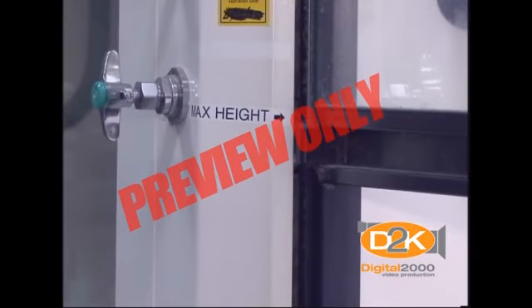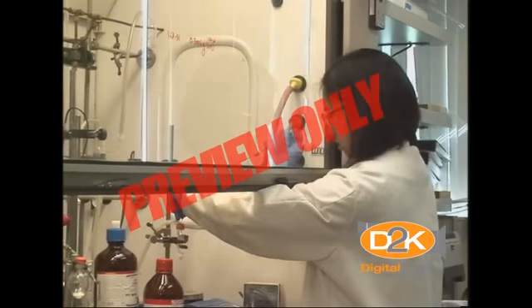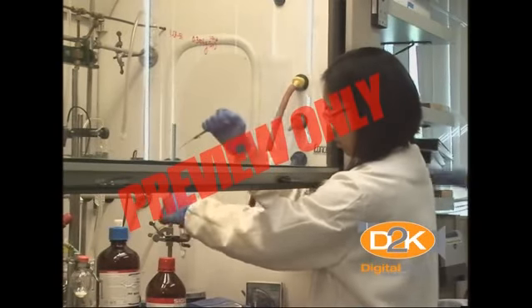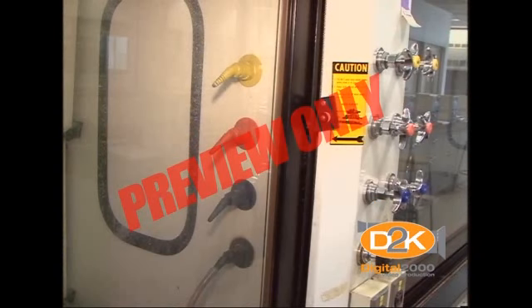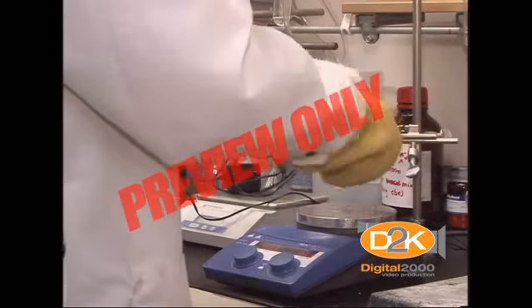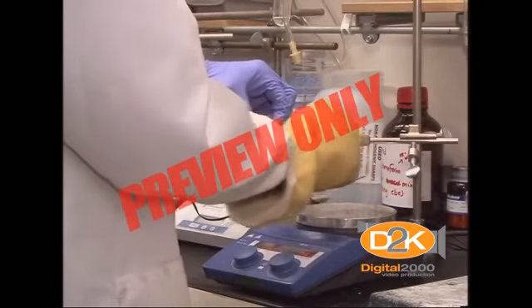Each chemical hood is labeled to indicate the best sash position. The exception is the variable volume exhaust hood. These hoods maintain 100 feet per minute at any position at or below the sash stop. All apparatus and equipment should be located at least 6 inches away from the hood face. This distance should be indicated on each chemical hood with black and yellow tape. You should always keep your head outside of the chemical hood. The only exception is when you are installing or dismantling equipment.